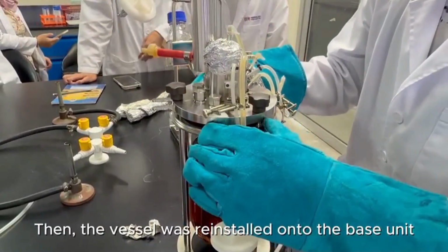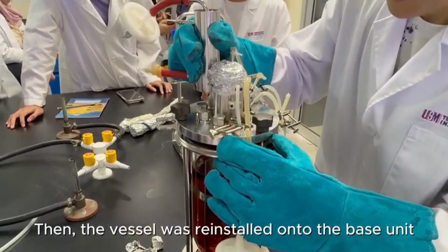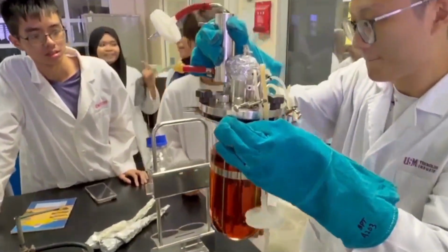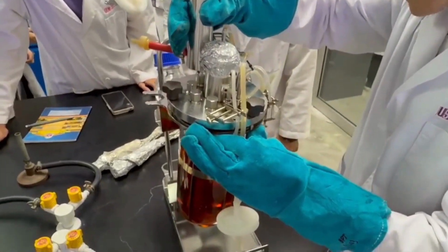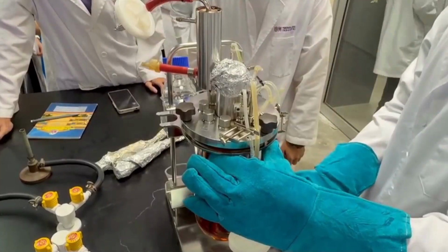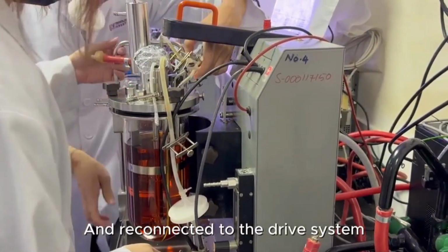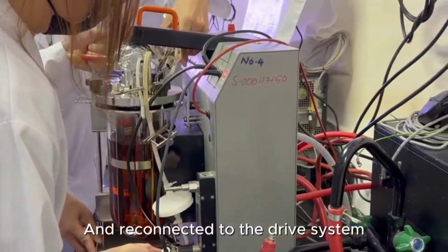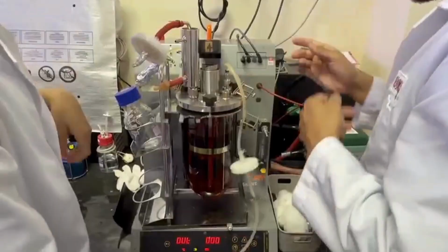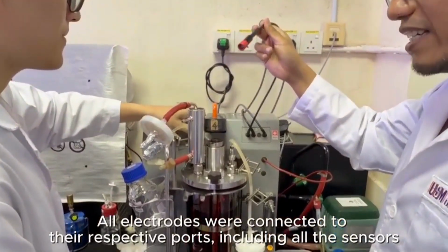Step 3. Reinstallation and sensors. Then, the vessel was reinstalled onto the base unit and reconnected to the drive system. All electrodes were connected to their respective ports, including all the sensors.